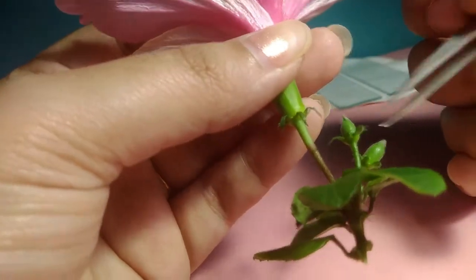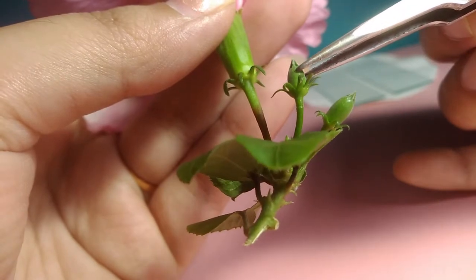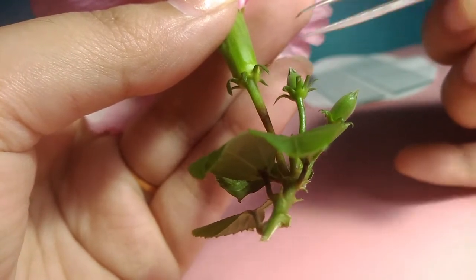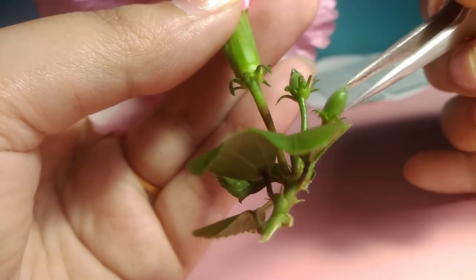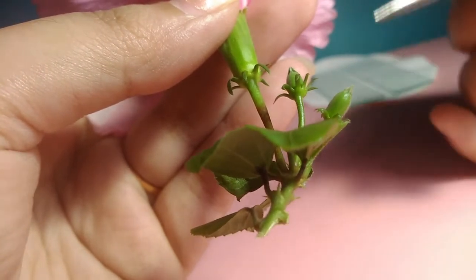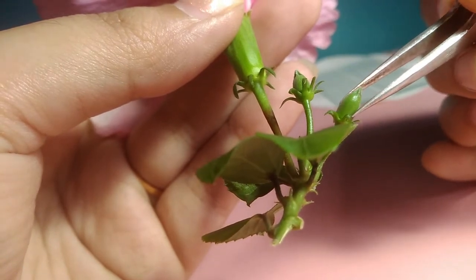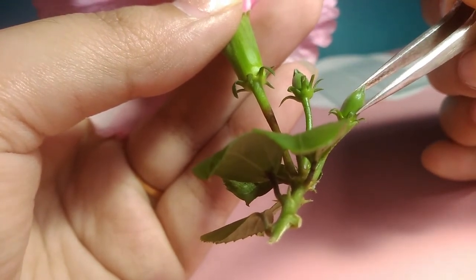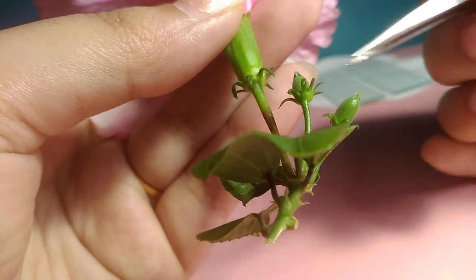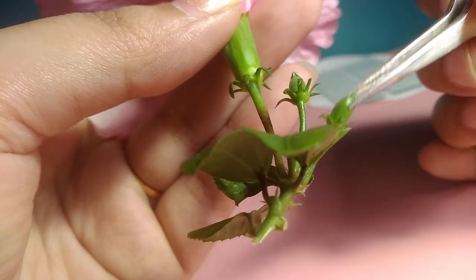Another interesting thing that we must note here, that in flower buds, this is a flower bud, okay, in flower buds the calyx covers the entire bud. It houses the entire bud. Why? Because the calyx provides protection to the developing bud. Calyx has a protective function. It is protecting the developing bud, and that is why it is covering the whole of it.